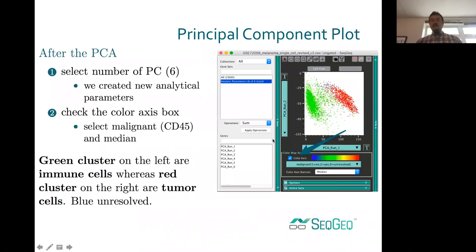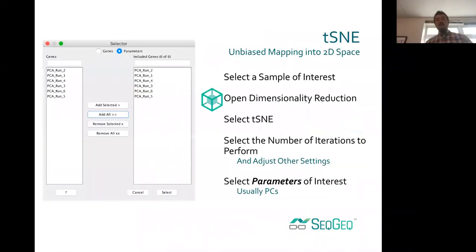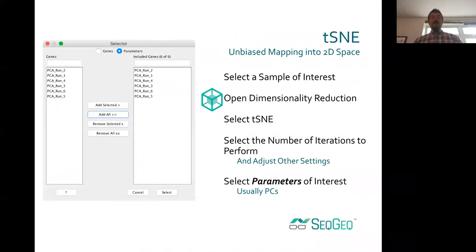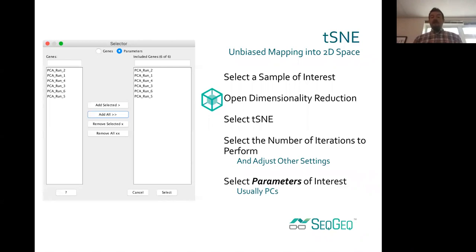PCA tells us a lot about global differences across the data set rather than subsets within it. So we may want to move on to other methods of dimensionality reduction, such as t-distributed stochastic neighbor embedding, or t-SNE. t-SNE works better running on a dense matrix — which is what you get from PCA — so it's very convenient to run PCA first and then utilize those principal components within the t-SNE visualization.